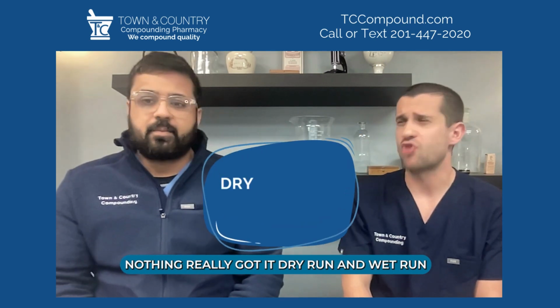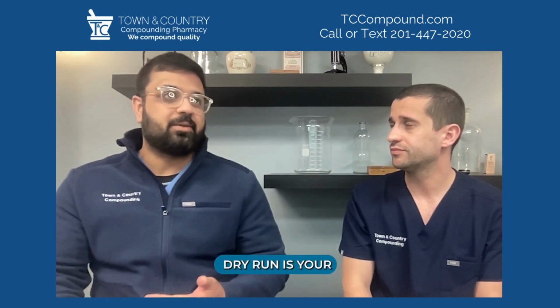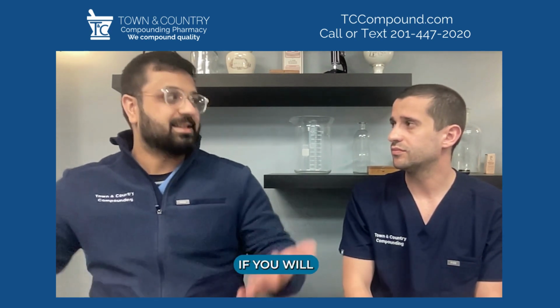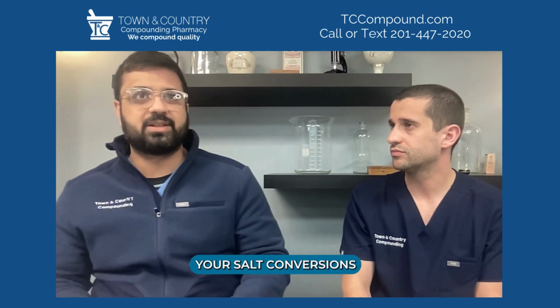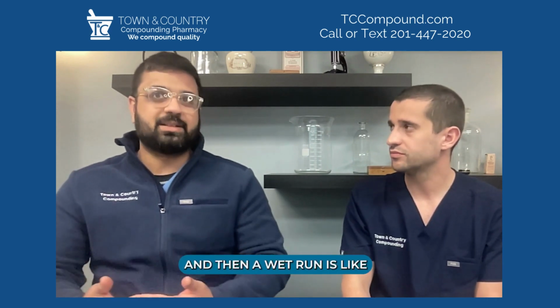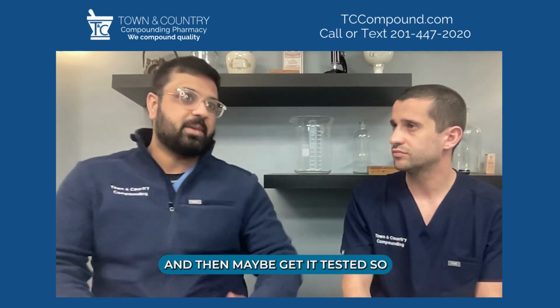Got it. Dry run, wet run. What's that? Dry run is your conceptual process, if you will. You haven't actually touched the drug yet. You're just doing the compatibility from a research standpoint: your salt conversions, your maximum dilutions, and what your pH might have to be. And then a wet run is where we actually get in the lab from our theoretical formula, try it out and see what happens, and then maybe get it tested.